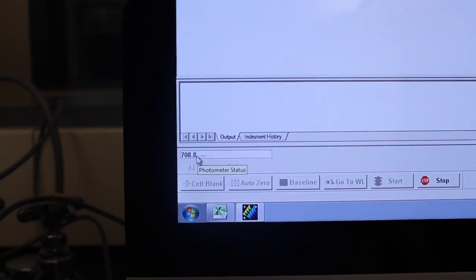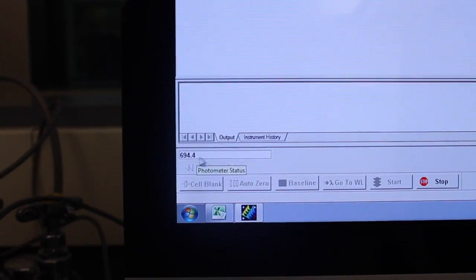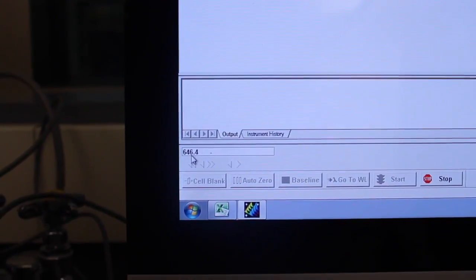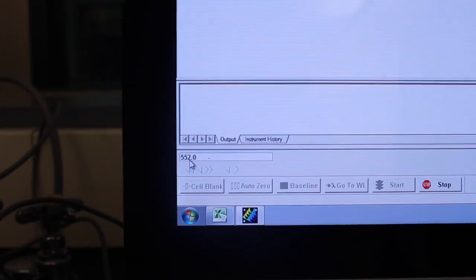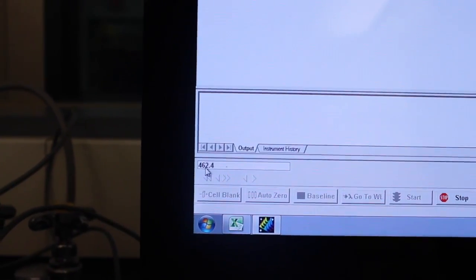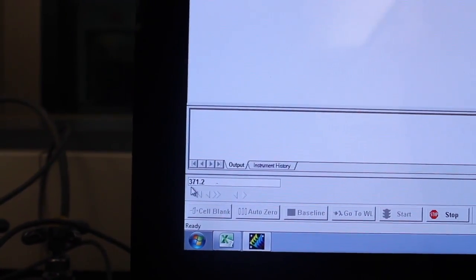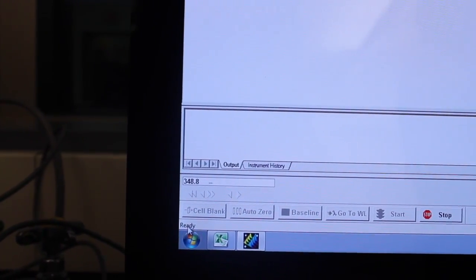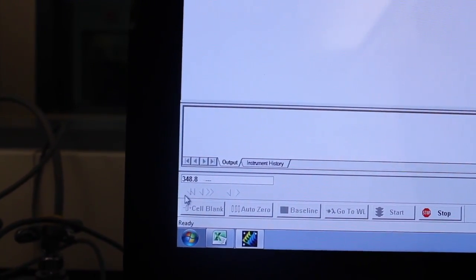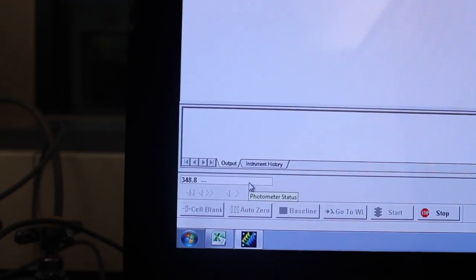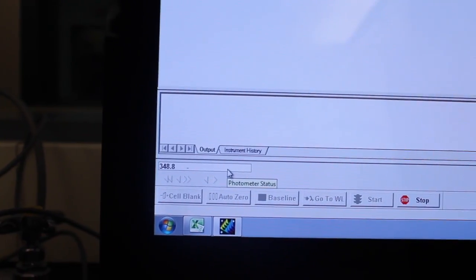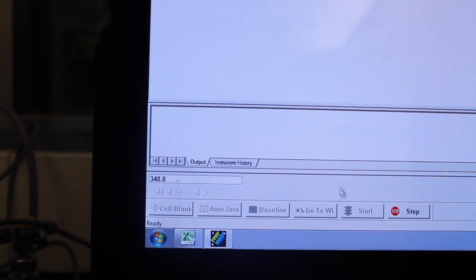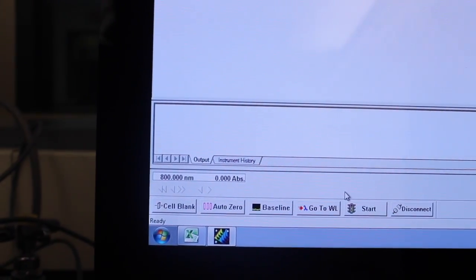The baseline will stop once it reaches the end of your range. When it is done, it will show the absorbance of the baseline, which is zero.